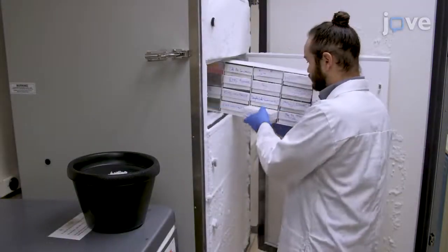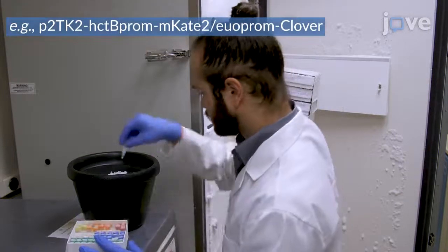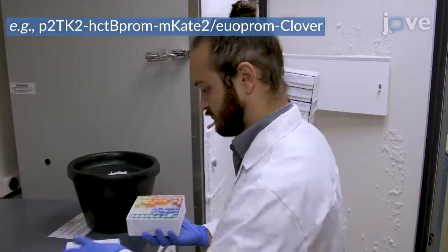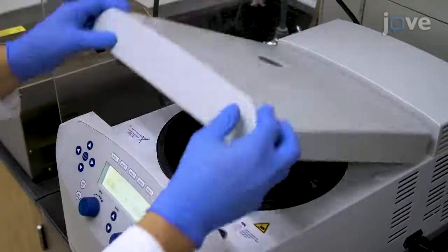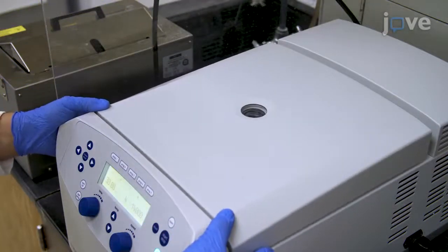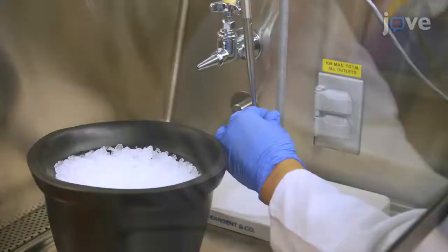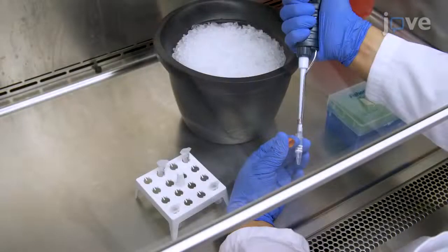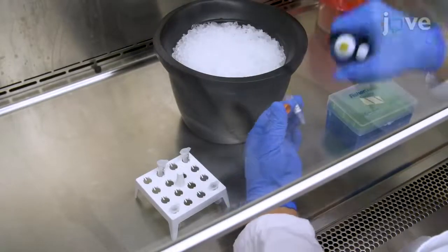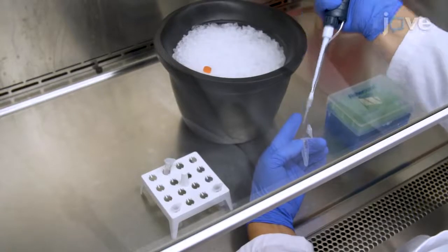To mutagenize a Chlamydia trachomatis reporter, thaw a chlamydial stock containing approximately 3 times 10 to the 7th elementary bodies transformed with the reporter plasmid of interest, and pellet the thawed stock by centrifugation. Use sonication at 10% power for 10 seconds to resuspend the elementary bodies in 100 microliters of axenic metabolism buffer, and split the resulting elementary body suspension equally between 2 1.5 milliliter microcentrifuge tubes.